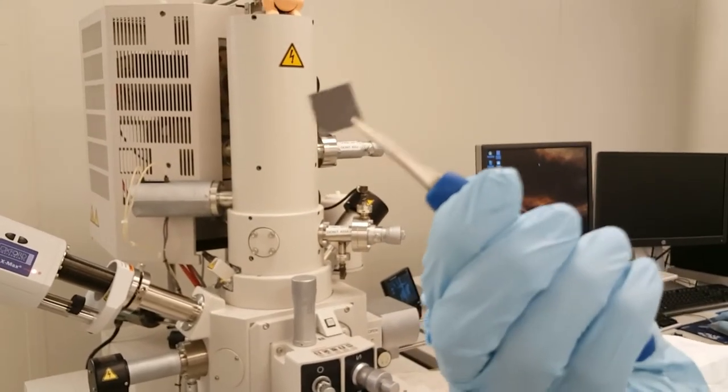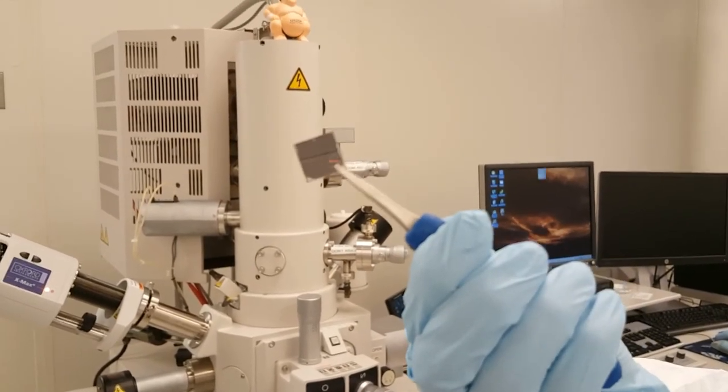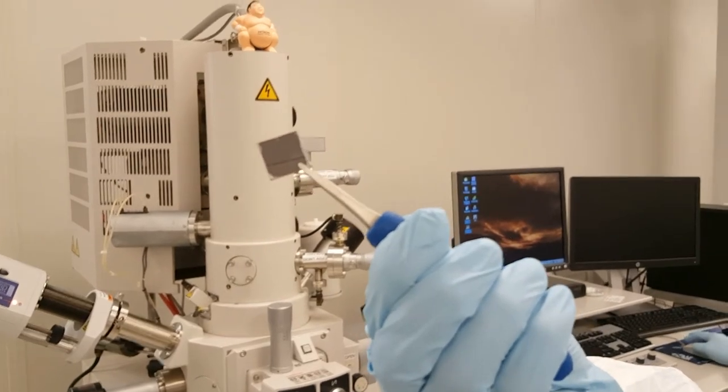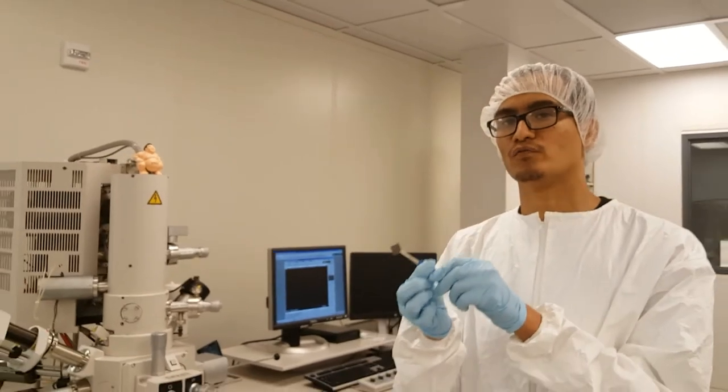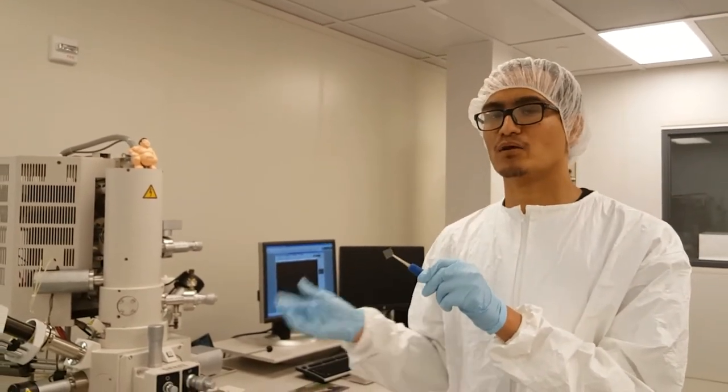So here we have a thin solid film of a light absorbing material called perovskite prepared by the spin coating process in our lab, and today we're going to show you the surface of this sample by the scanning electron microscope.